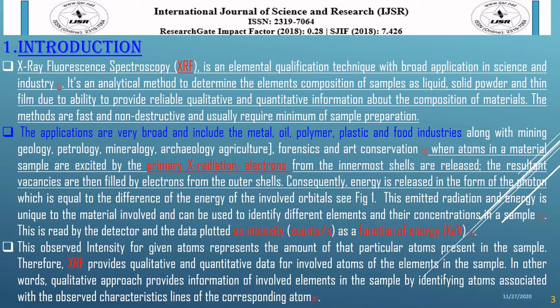Introduction. X-ray fluorescence spectroscopy is an element quantification technique with broad application in science and industry. It is an analytic method to determine the elemental composition of a sample as liquid, solid and thin film. Here we find the applications are very broad, including metal, oil, polymer, plastic and food industries.